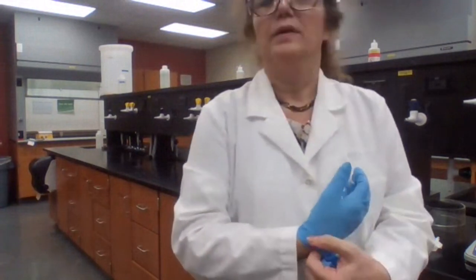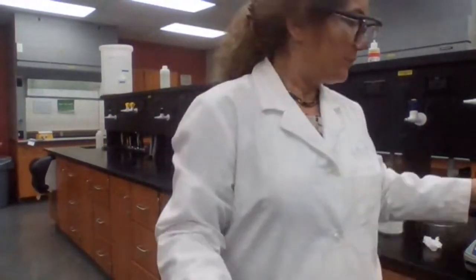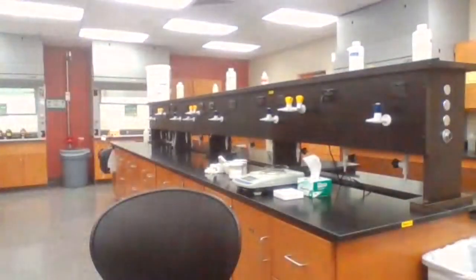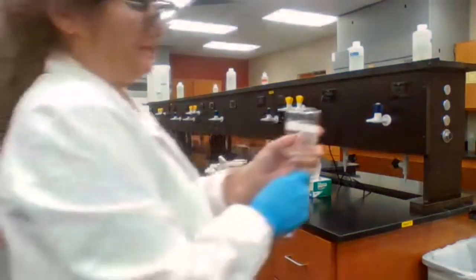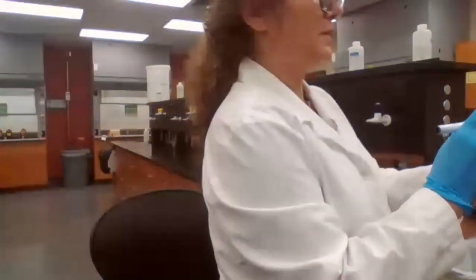What's your next step? You don't have to write the reports until Thursday, right? For Thursday, the first thing, I'm going to save the sample and I am going to do the IR first thing for the lab on Thursday. We would do first IR and then we do the rest of the other experiment. Going to save the sample, going to label it and save it. We have a cabinet that when we are saving our sample, we leave it in the cabinet for Thursday. And I'm just going to write my name because I was the one here.